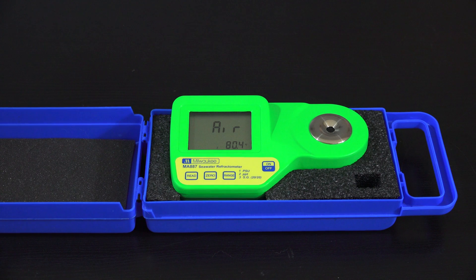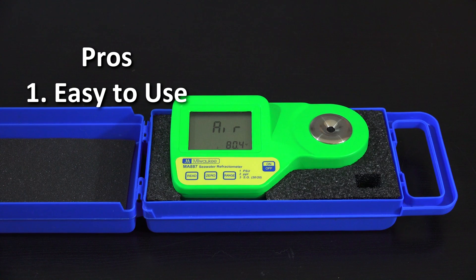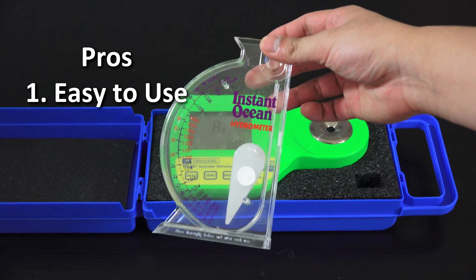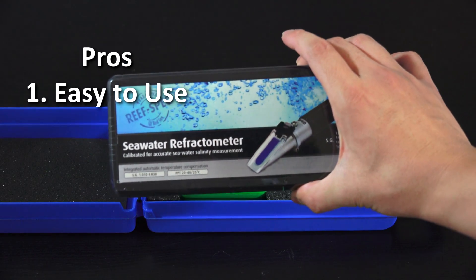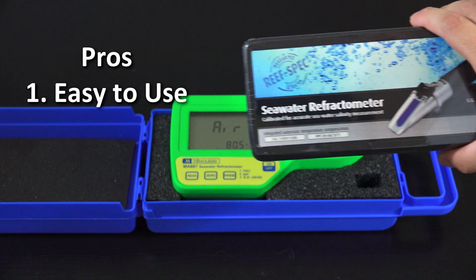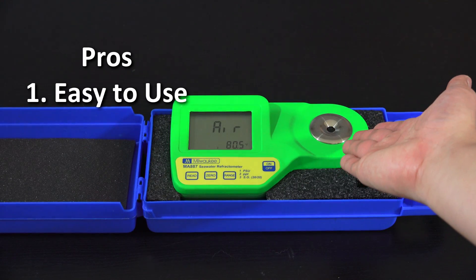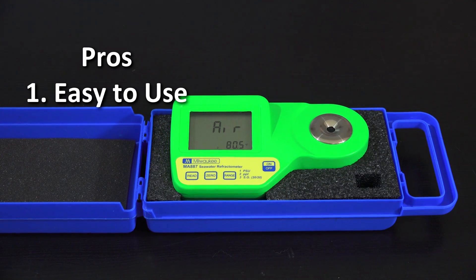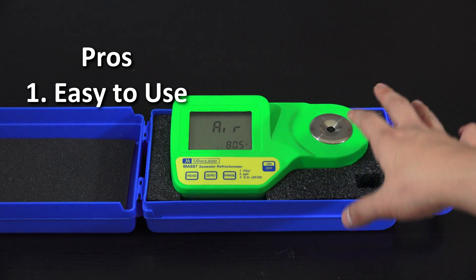The first pro is that it's super easy to use. You literally press a button and it reads the value for you, instead of guessing where a line lands or putting your eye up to an eyepiece and trying to read it. The machine does it for you. It also has a temperature gauge because temperature does play into your salinity level.